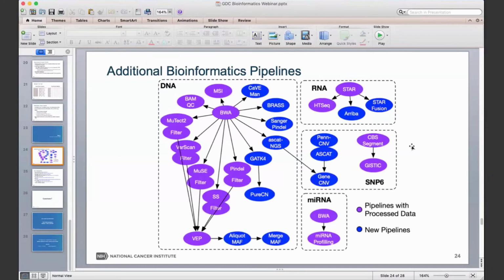So for the typical size, we have very different sizes. I will take TCGA as an example. For whole exome, the typical depth of tumor is about 150x, and normal is normally less. For the whole genome data from TCGA, the tumors are normally 40 to 60x, and normals could be 30 to 40x.